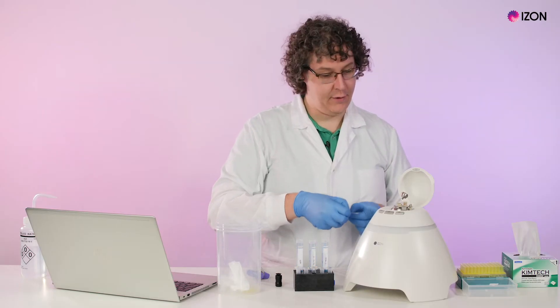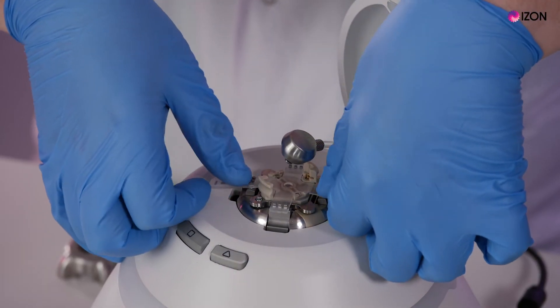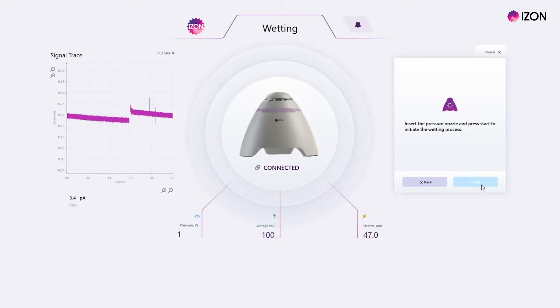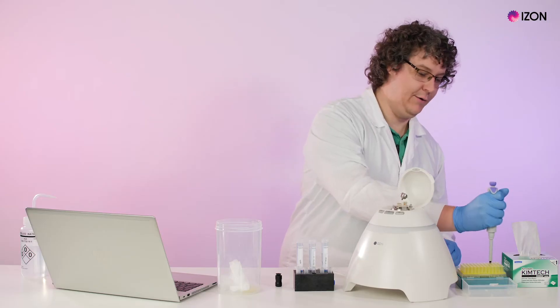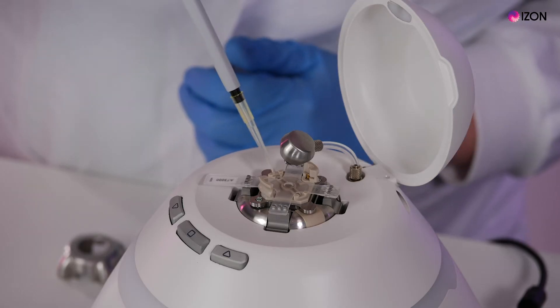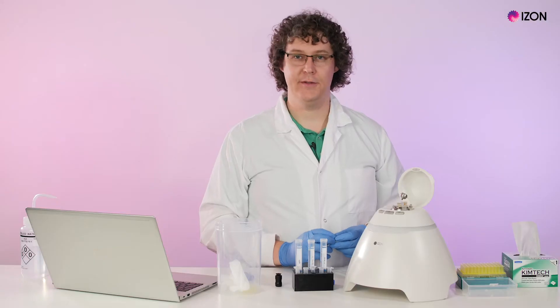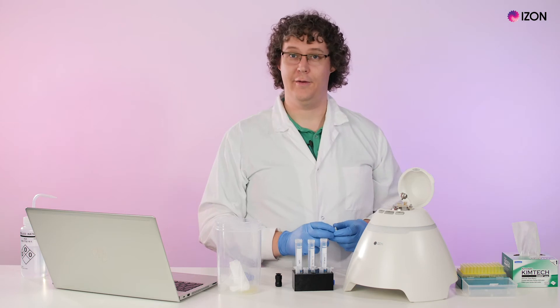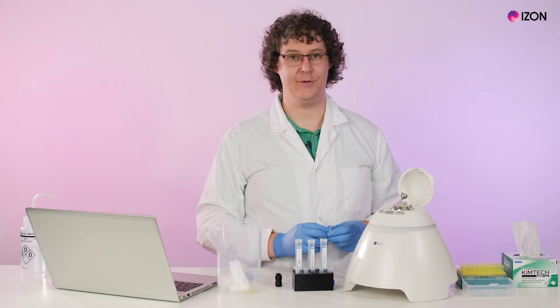Reload the nanopore on the stretcher and click OK. Wait for the stretcher to move to the setup position, then load 75 microliters of your measurement electrolyte into the lower fluid cell. Check if there are any bubbles visible under the pore. If there are any bubbles, you'll be prompted to remove and clean the pore and then load electrolyte again.